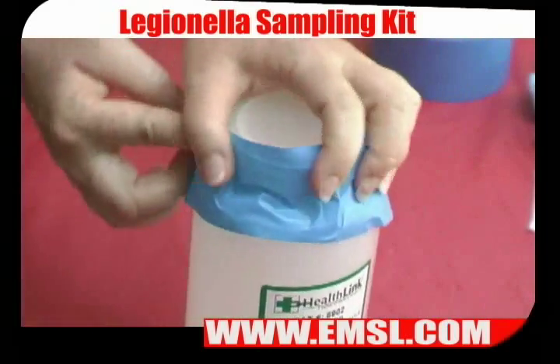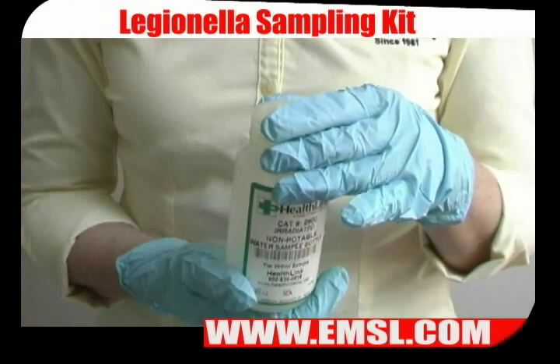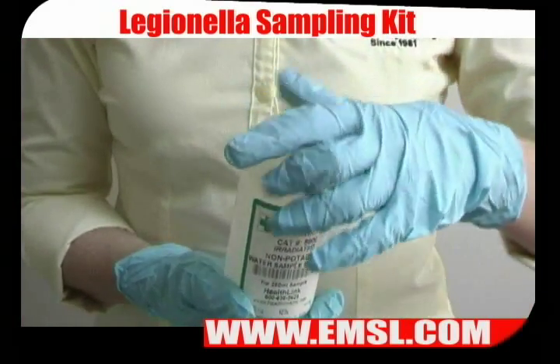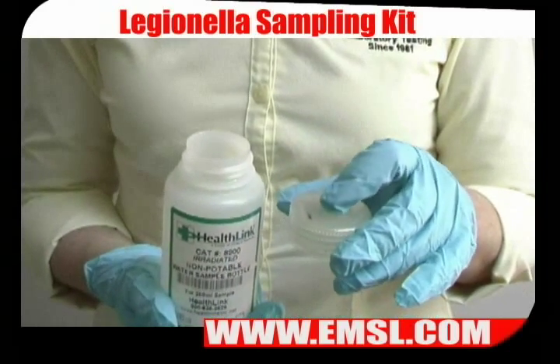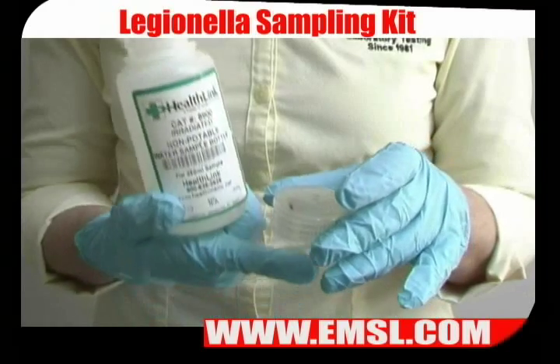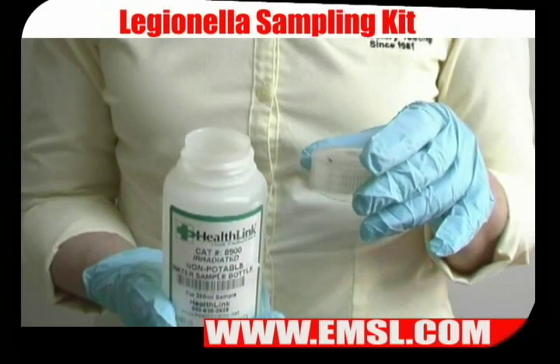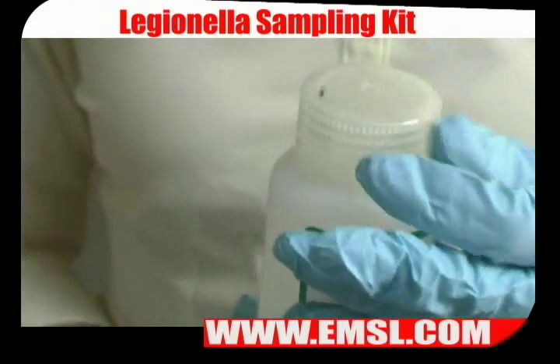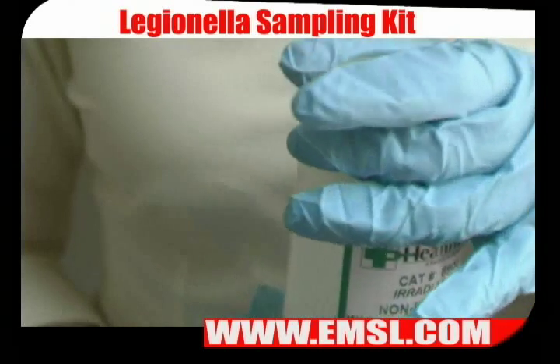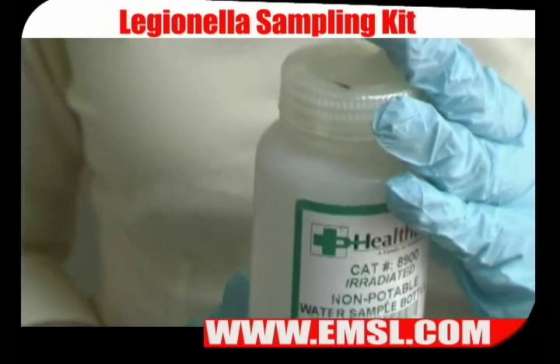Seal the bottle with electrical tape. Now for sampling non-potable water: again, unscrew the lid and make sure that you keep the topside up to avoid contamination on the underside of the lid. Next, fill the bottle from the water source. When you're finished sampling, screw the lid back on the bottle, seal the bottle again with electrical tape, wipe it down with an alcohol wipe, identify it, and then send it off for shipping.